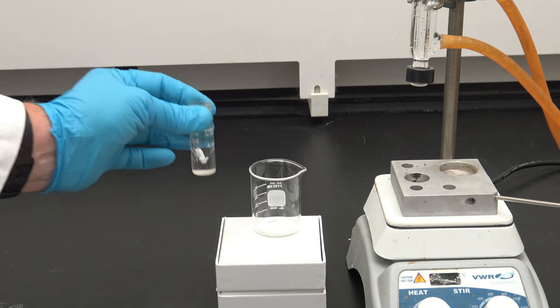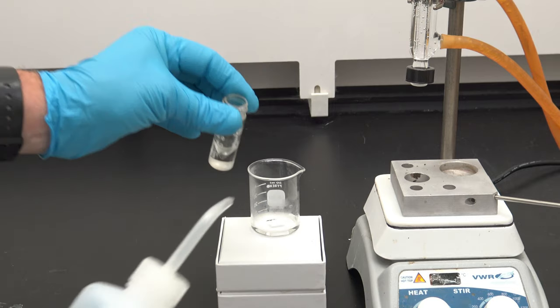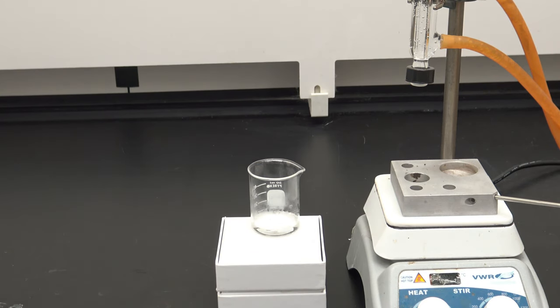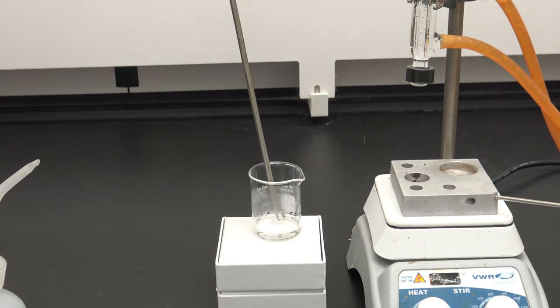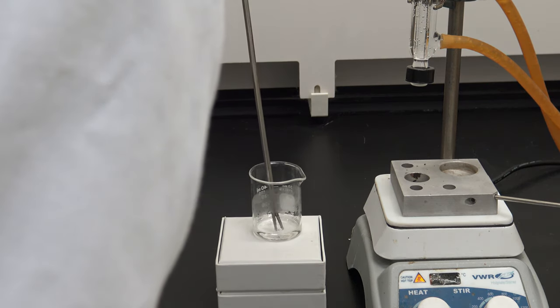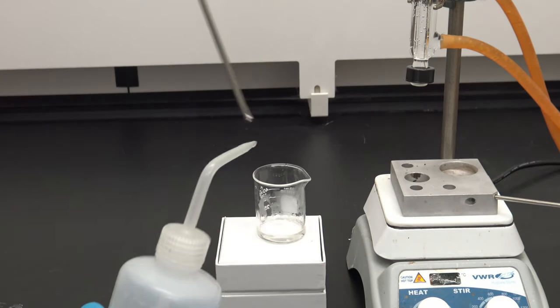I'm now going to pour the contents of my reaction vessel into a 50 milliliter beaker. I'm also going to use a little bit of DI water to rinse that out. Then I'm going to pull off my boiling chips using this forceps here. Rinsing that one off. Rinsing that one off, and I have one more to get out of there. Rinsing that one off.